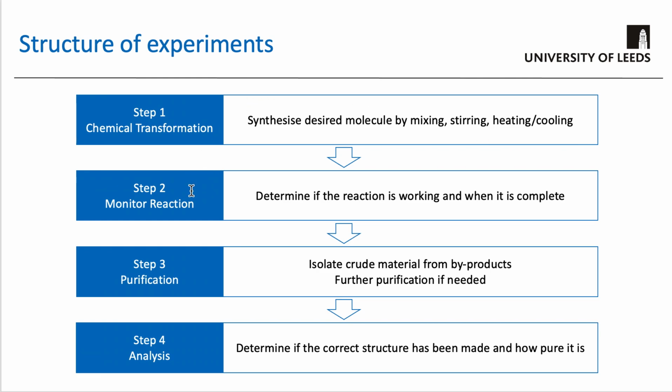Now the next stage is to actually monitor the reaction as it's undergoing, and to see if the reaction is complete before moving on to the next stages. Because what you want to do is assess the progress of the reaction. Is it actually working? Am I forming the product? If it is working, is the reaction complete? Or if it isn't working, what is happening instead? Am I forming byproducts instead, or is it just staying as starter material? Do I need to change the actual reaction conditions to make it work?